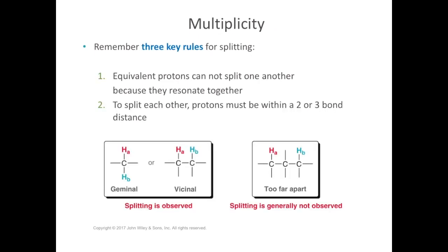There are 3 key rules for splitting. Number 1, equivalent protons cannot split one another because they resonate together. Number 2, to split each other, protons must be within a 2 or 3 bond distance.